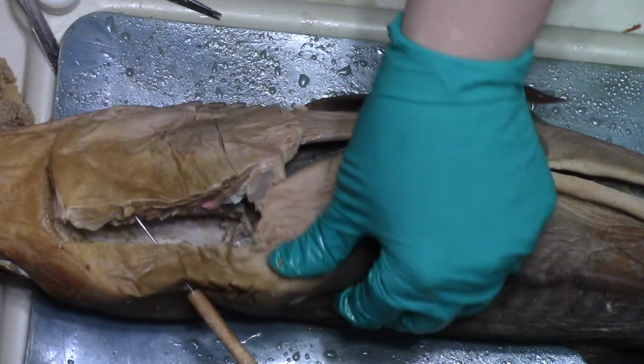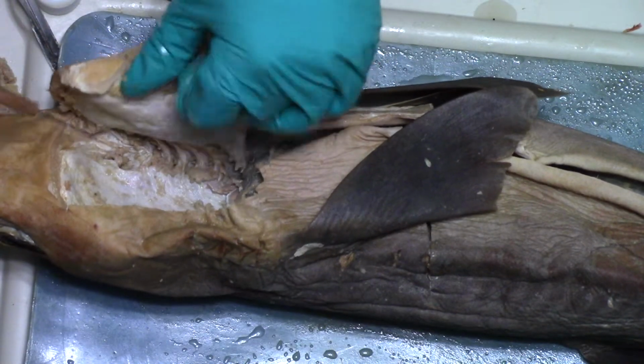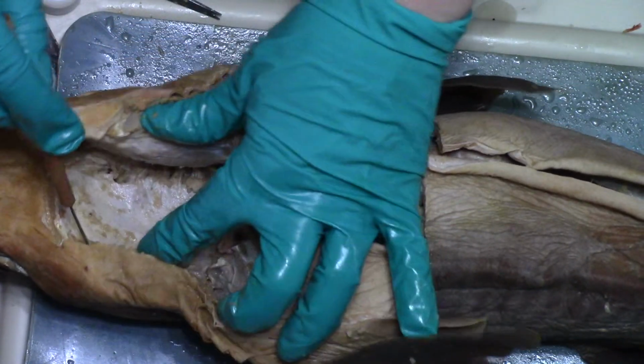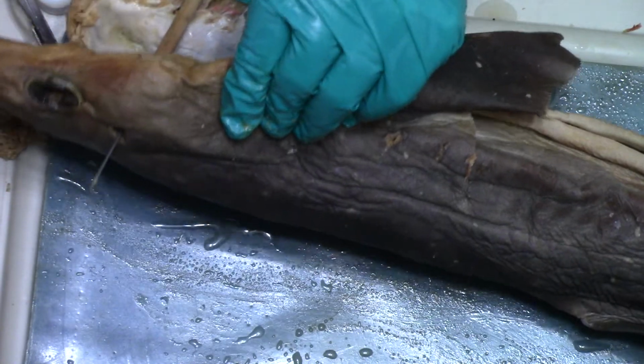Oh, you can't see that. Those are the external gill slits. Like I said, there's one spiracle. The other one's up here. There's another spiracle up here. You can see.